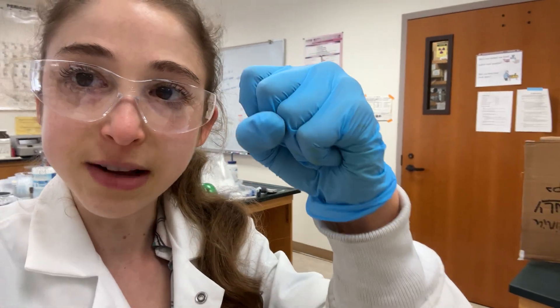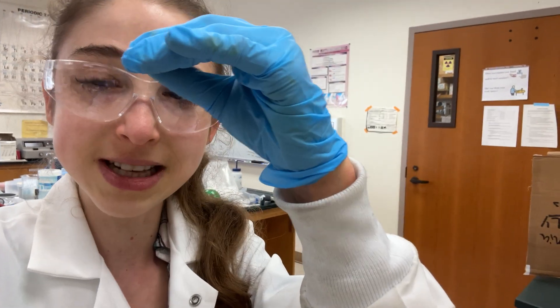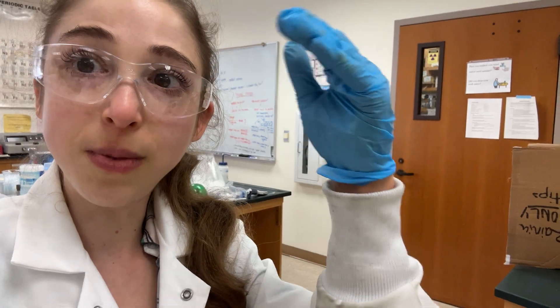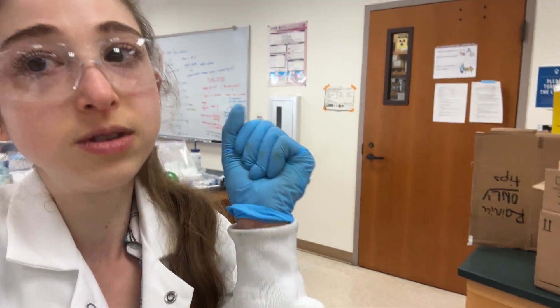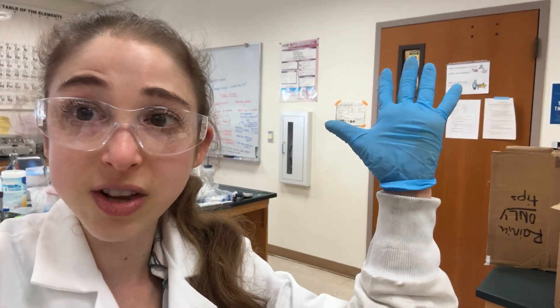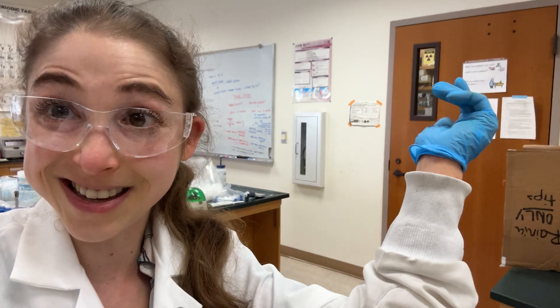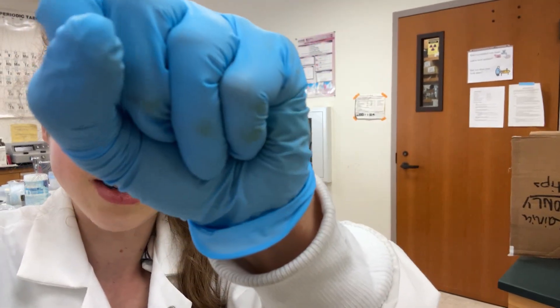It's like a rock — and when it's a rock, the dye can't bind, and the water steals the fluorescence. When the dye gets to bind to the hydrophobic regions of the protein as it unfolds, you get the fluorescence. But when too much protein is unfolded and everything sticks together, the dye gets kicked out, back to the water, and the signal gets quenched.